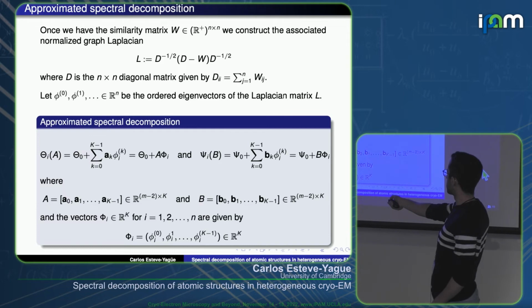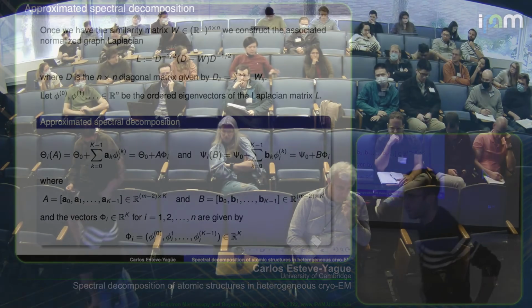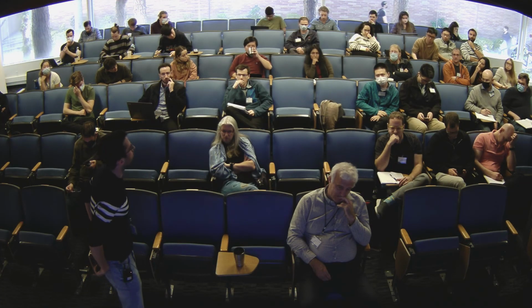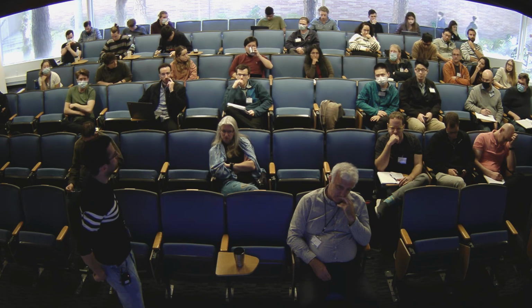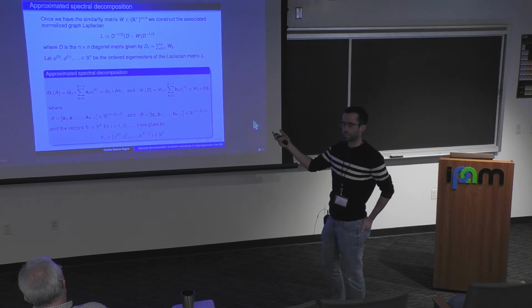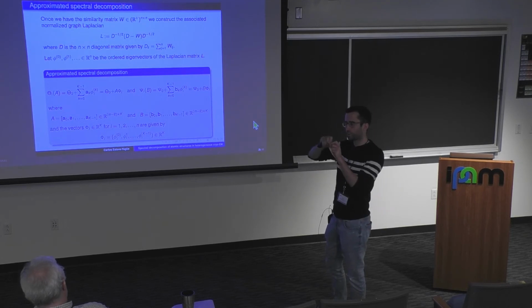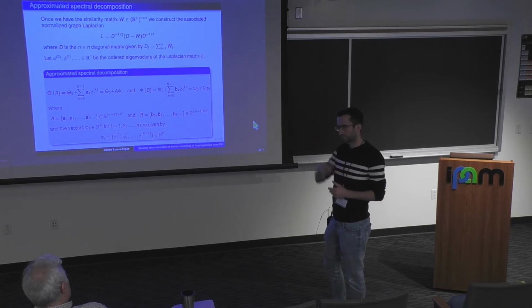And then this gives us, for each particle, yes? So this assumes you have a discretized version of the manifold available of the conformation. Yeah. So here is where we use this low dimension representation of the particles, of the conformation in the particles, that you can take from this PCA representation or from the latent space in a variational autoencoder. You have a low dimension representation of the particles, then you can compute the distances between them.